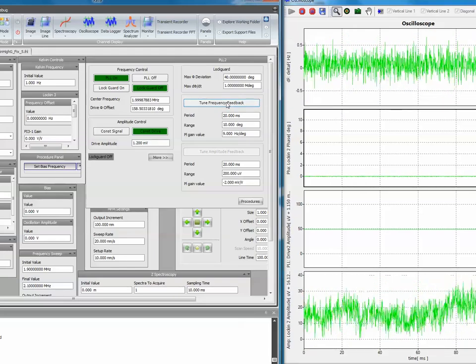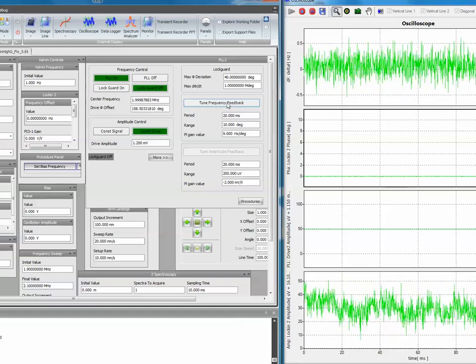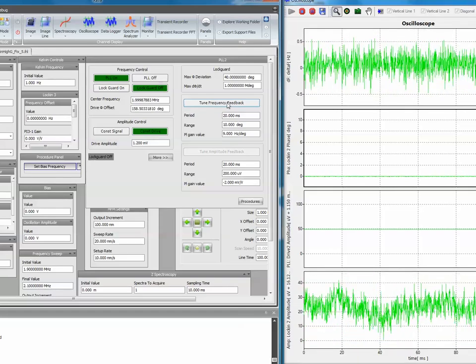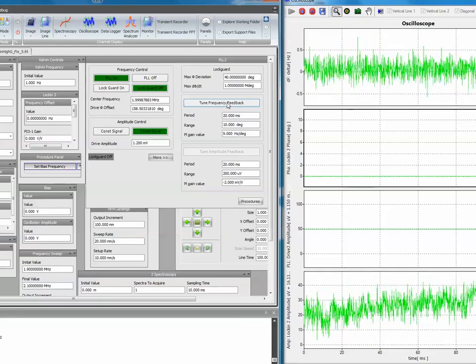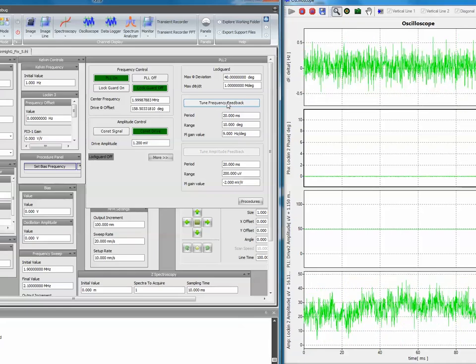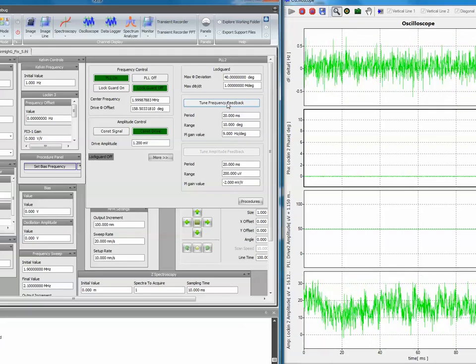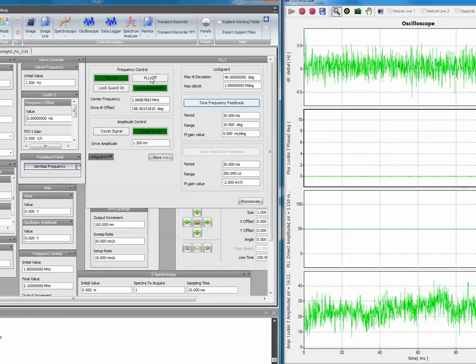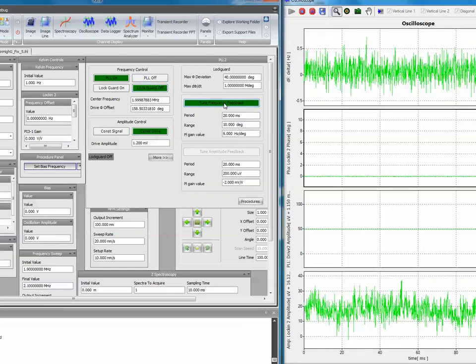So there is a trade-off between noise on the delta F and steepness of the phase curve in your interface test. The calculation that you should do is you have a certain number of pixels per image scan line. There's a certain scan line time, and within that scan line time, the PLL should be able to respond to the number of pixels inside the image. Otherwise, you see mostly PLL behavior. And so this is basically what you have to tune for.